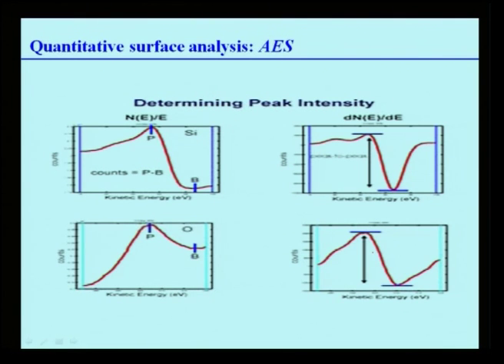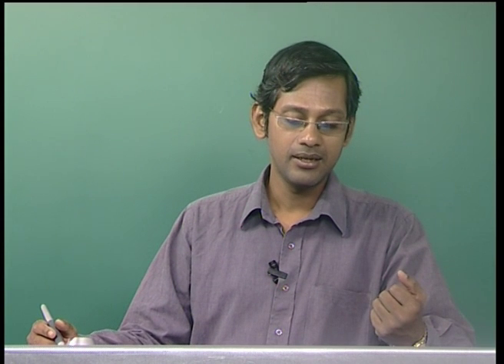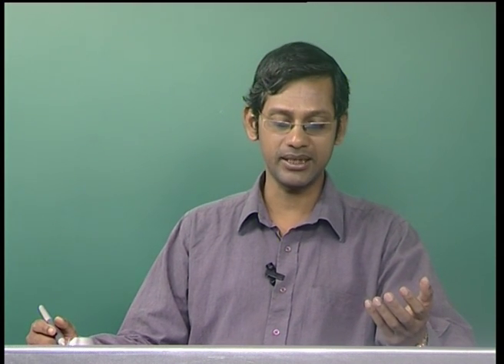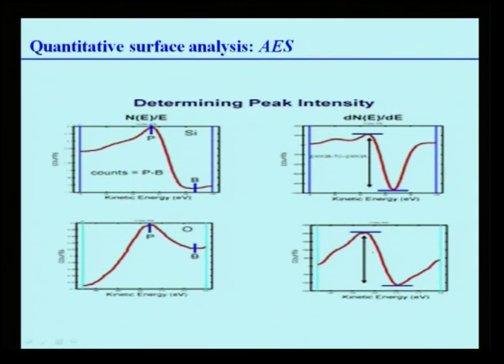Well, to determine the peak intensity is very important, because you want to calculate the area under the peak to know the intensity. So one has to be very careful when measuring the peak intensity. I am showing you some plots to make you understand how that judgment is very important. So this is the kinetic energy, this is the CPS.